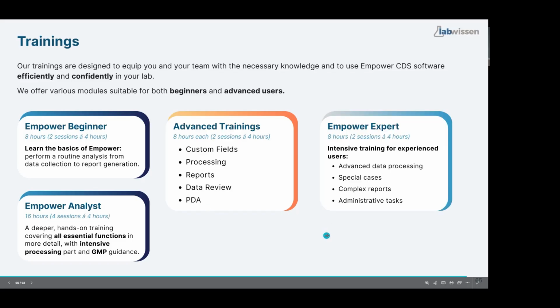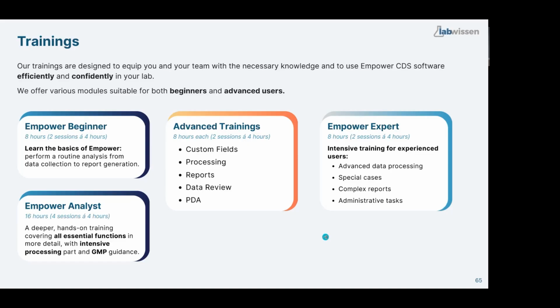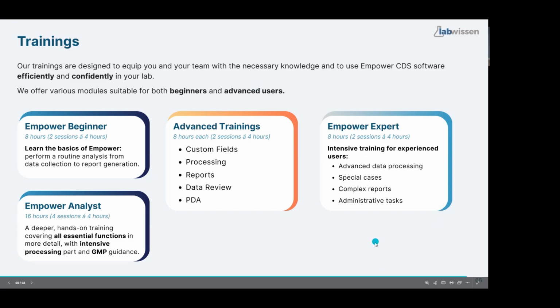Okay, and there is also one more training, Empower Expert, that was designed for users that have already used Empower for quite a long time and want to gain deeper knowledge in processing, in reporting, in some administrative tasks. So this training is quite flexible. I just make it based on your requirements, what you want to learn, some specific cases.